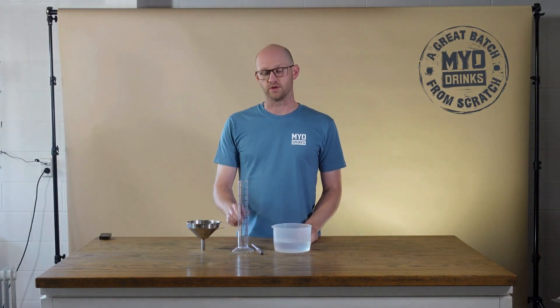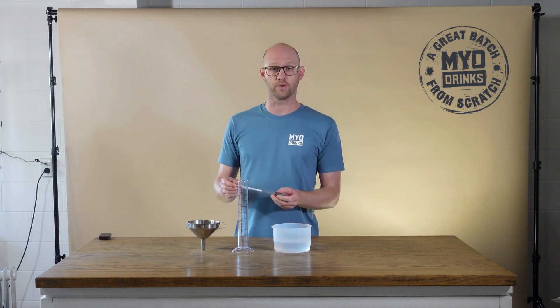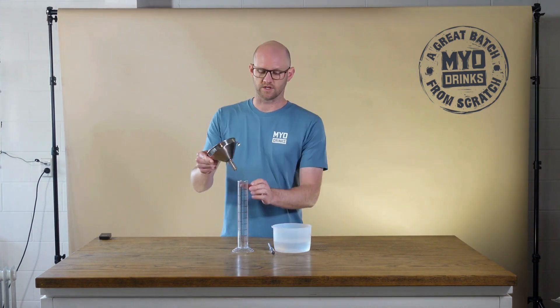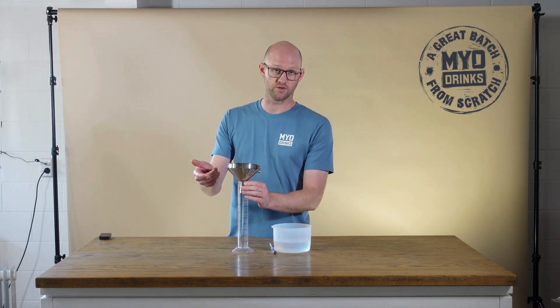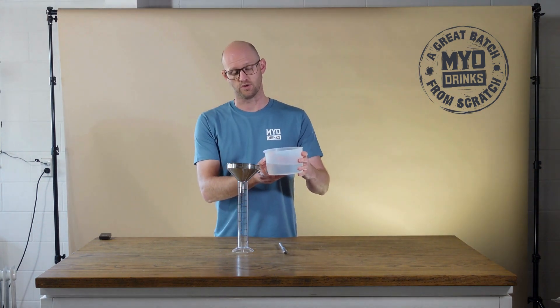To use an alcometer you'll need a trial jar, and you'll want to make sure your alcometer is nice and clean. It's a good idea to use a funnel, and then you can pour your spirit into your trial jar.